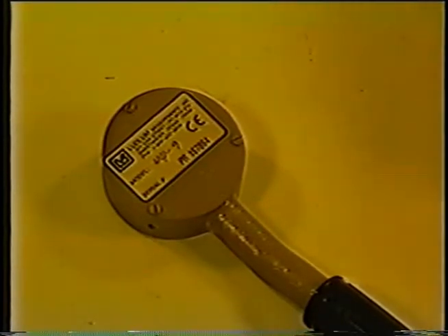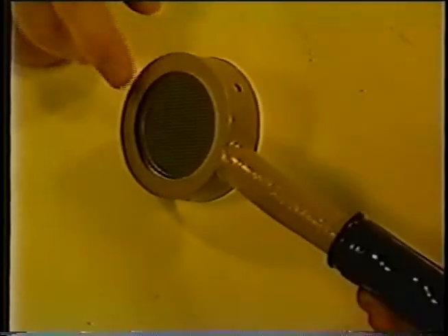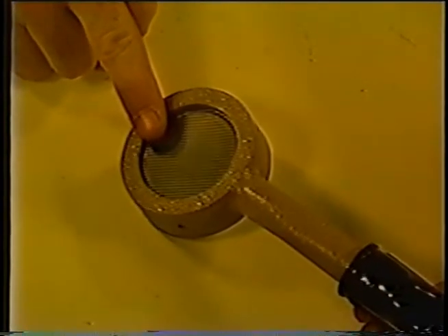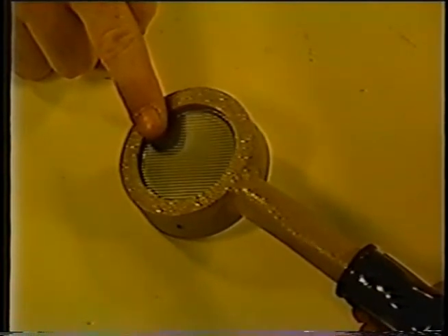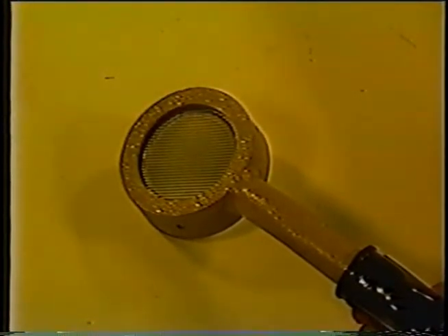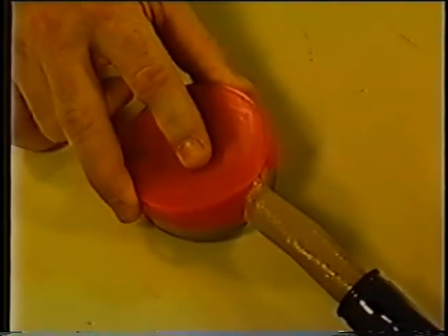The Model 44-9 GM detector is capable of detecting alpha, beta, and gamma radiation. It contains a tube filled with halogen gas and has a thin mica window. A stainless steel screen helps protect the window from damage. Caution should be taken when using the detector around vegetation or any sharp objects, because the mica window is easily damaged, causing the detector to fail. A plastic cover should be used to protect the window when the detector is not being used. The plastic cover can remain in place when surveying for gamma radiation, but it must be removed to detect alpha or beta radiation.